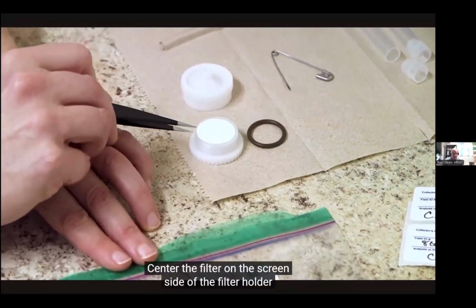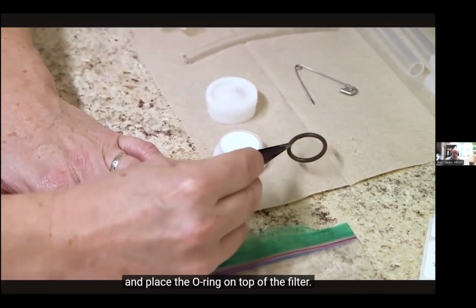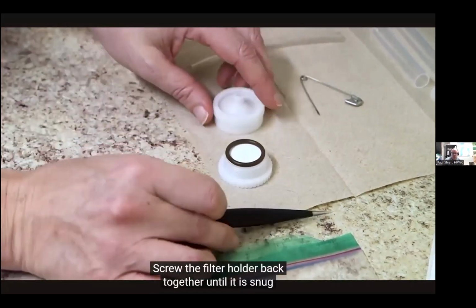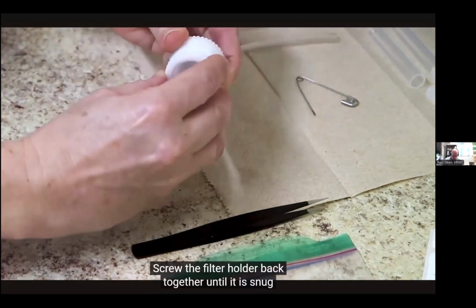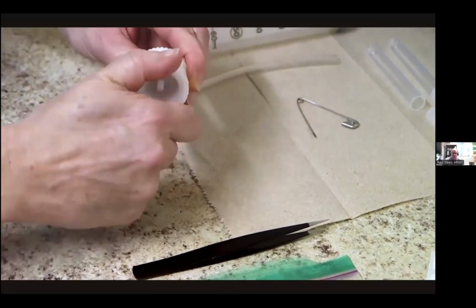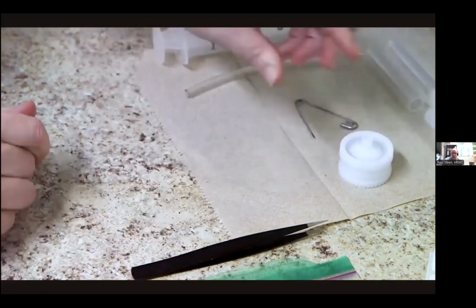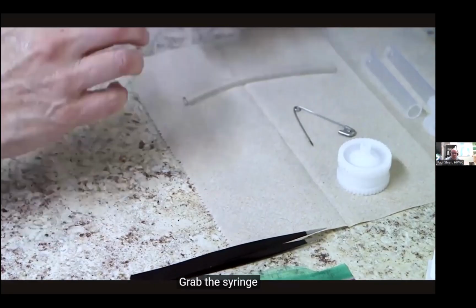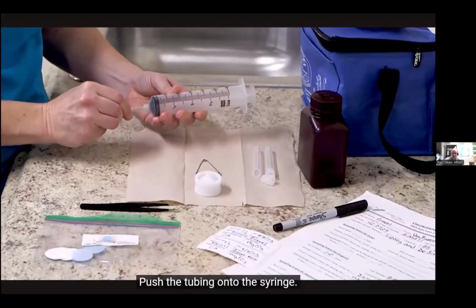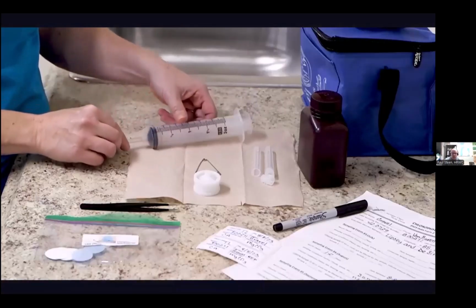Center the filter on the screen side of the filter holder and place the O-ring on top of the filter. Screw the filter holder back together until it is snug and place it to the side. Grab the syringe and the small piece of clear plastic tubing. Push the tubing onto the syringe. It does not snap in place but will fit snugly.